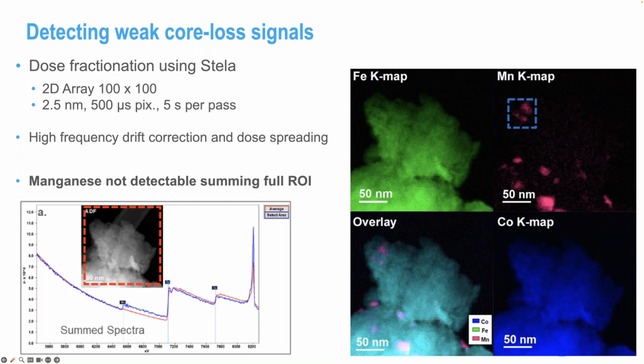Jump ratio for the blue spectrum in the manganese K edge is good, and basically the jump ratio for the red spectrum is absent. So in this particular example, and it's probably true of many examples, it wouldn't be sufficient for us to just defocus the probe or work with a massive probe and have no spatial selectivity. We would not detect the thing that we're looking for, or we'd miss important information. So having decent spatial resolution as well as high sensitivity, both of these things are important. Really nice example that Andrew's done.